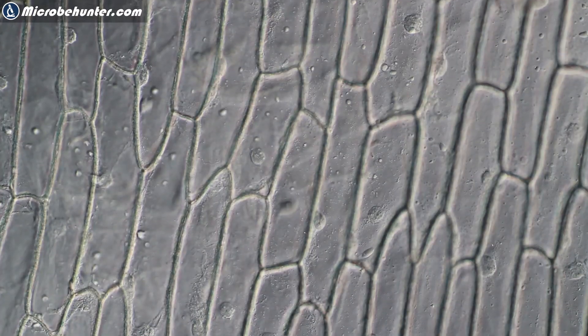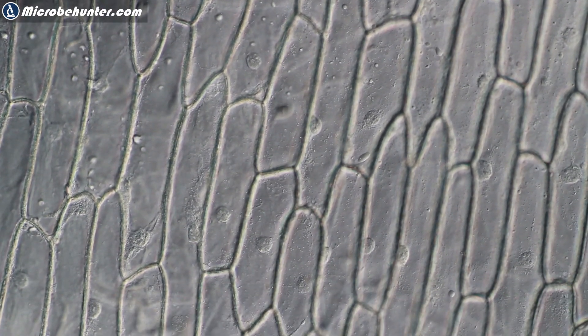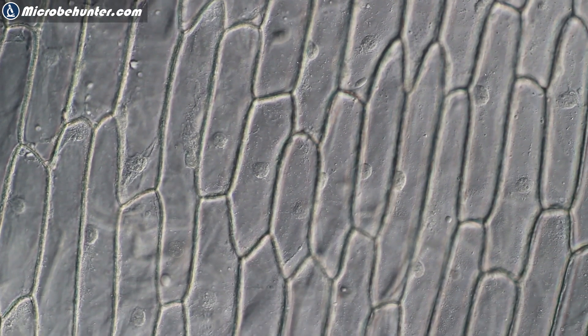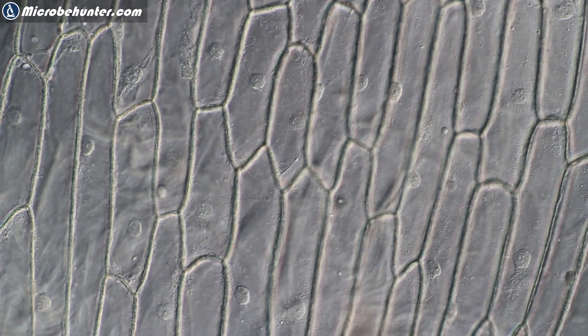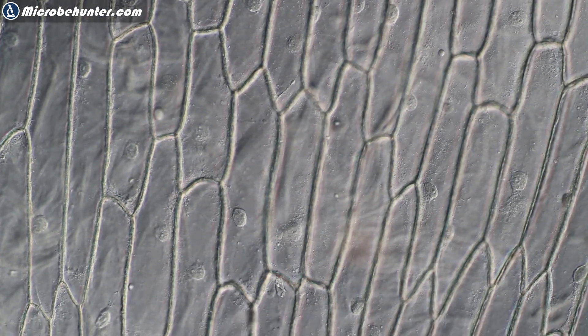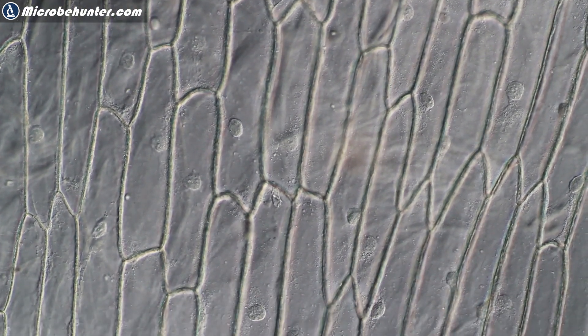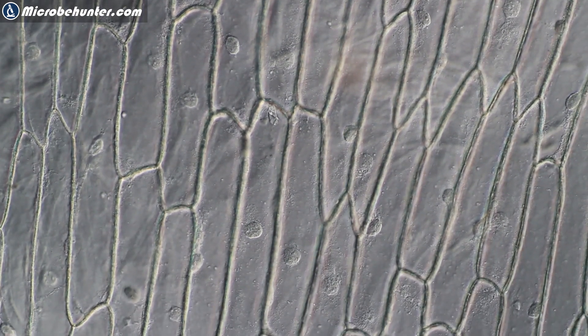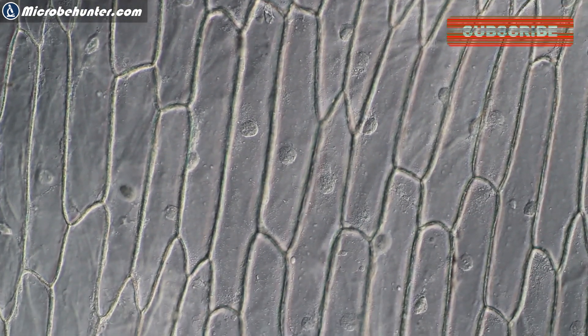Now, this video I made by simply turning the knob of the mechanical stage, and as you can see, it's not entirely smooth. I tried to rotate it in a very smooth way, but of course that's difficult to do. It doesn't matter.